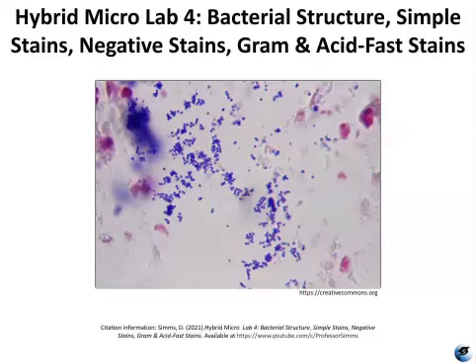Hello, I'm Professor Sims, and this video is about bacterial structure, simple stains, negative stains, Gram, and acid-fast stains.